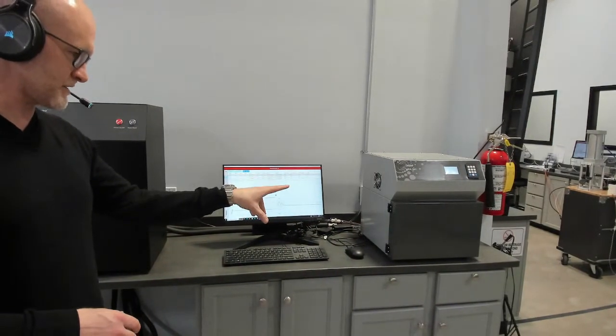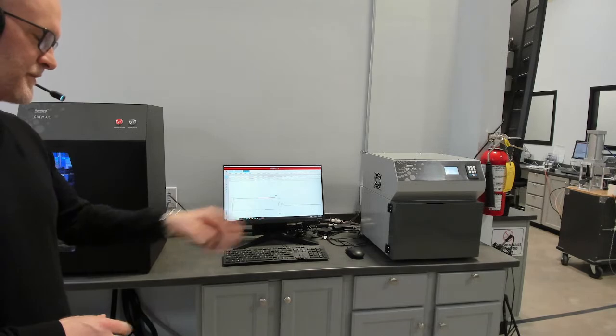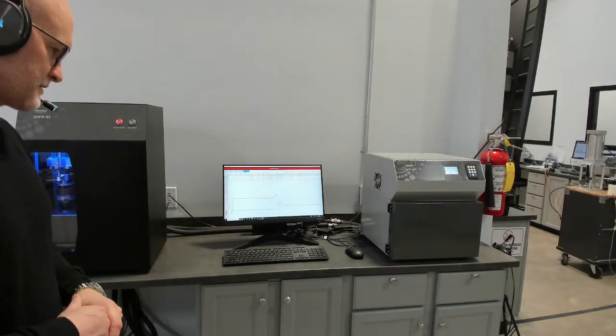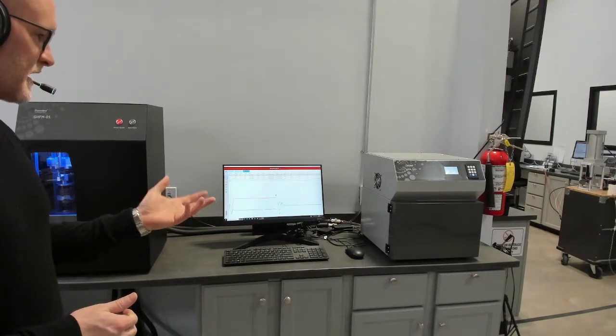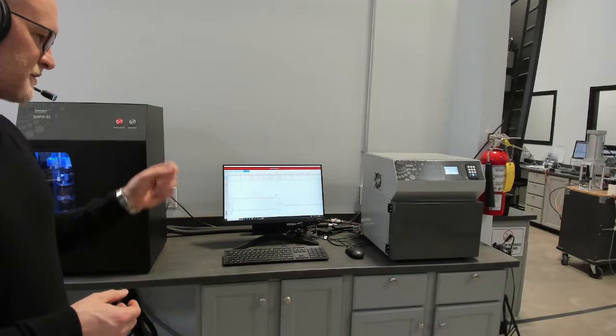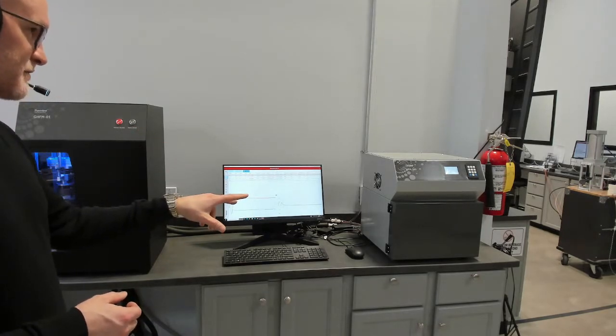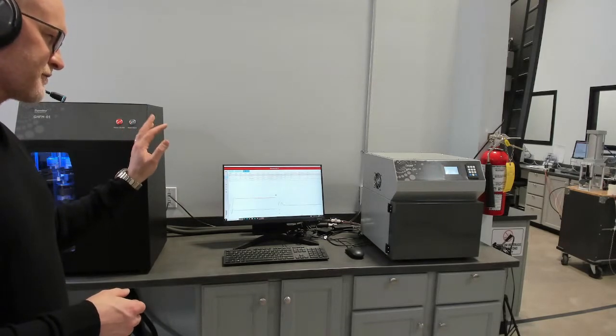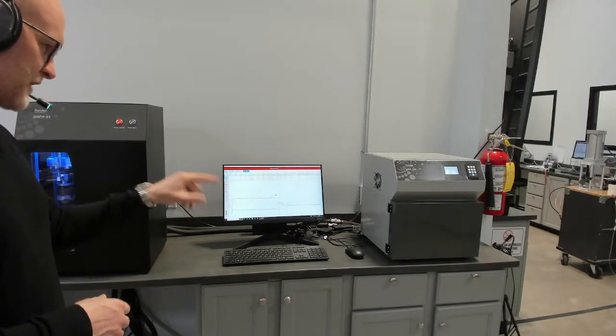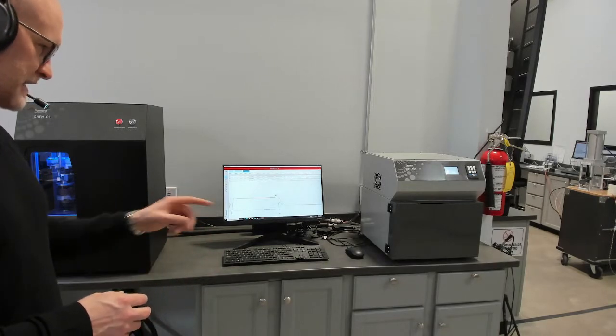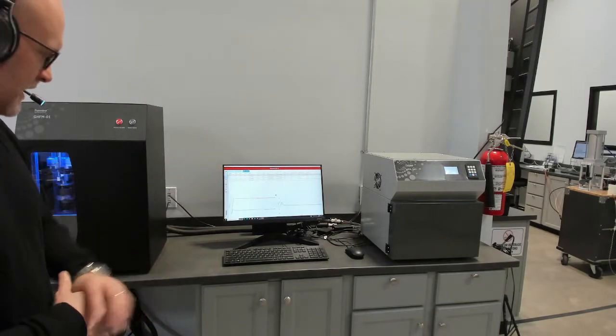This is our other steady state device which is heat flow meter. This follows ASTM C518 along with the other related ISO standards. This is for measuring heterogeneous insulation and construction materials. The thermal conductivity range of this method is 0.003 up to 0.5 watts per meter Kelvin and then there's an extended range thermal conductivity kit that you can plug into it to go up to two and a half watts per meter Kelvin.